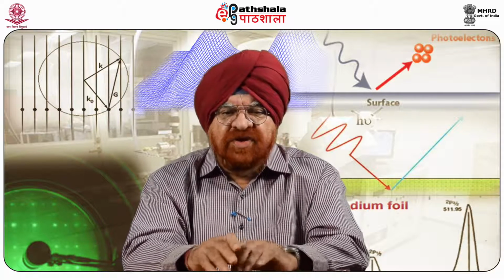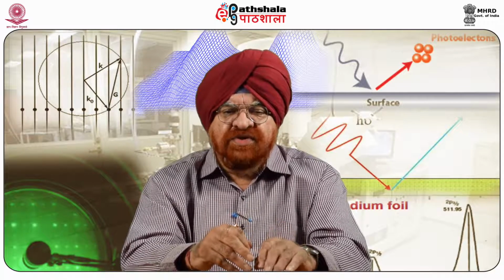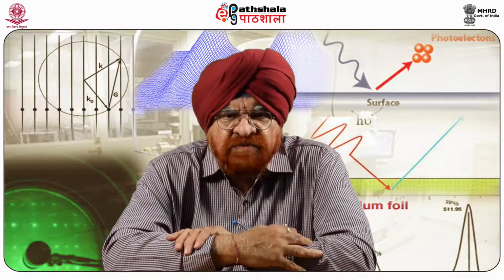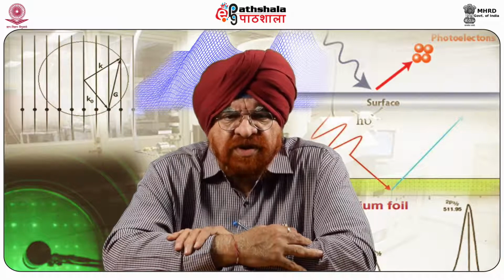Minor and major differences between smooth surfaces and rough surfaces are shown dramatically. On one hand, the AFM can resolve very tiny features, even single atoms, that were previously unseen.